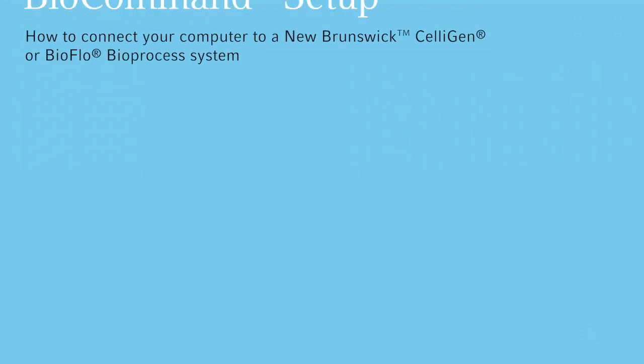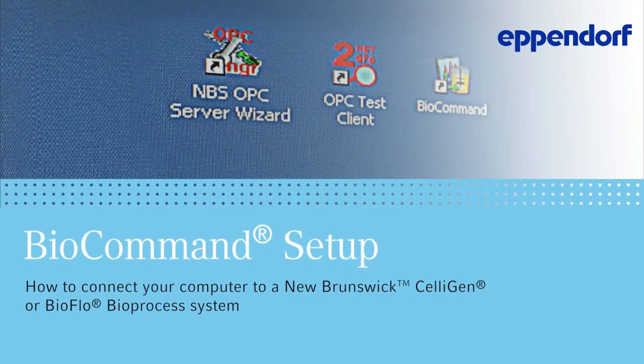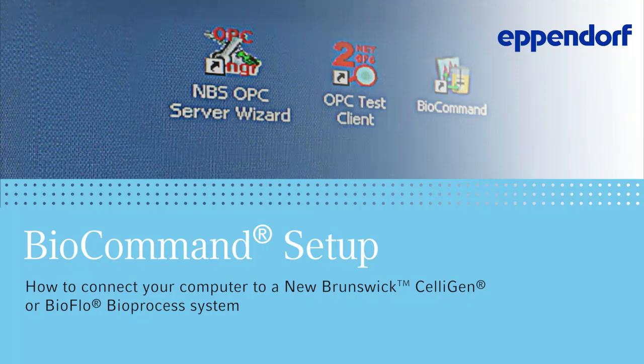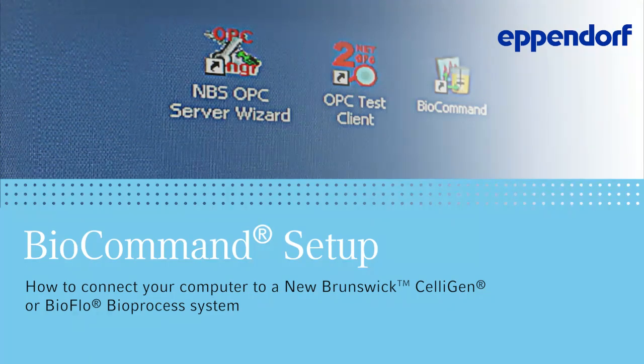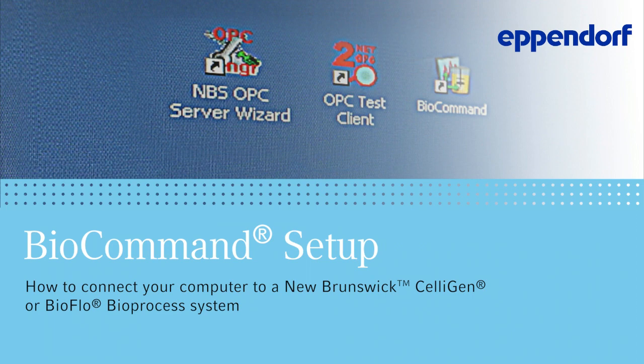The purpose of this video is to demonstrate how to connect your computer to a New Brunswick Celligen or BioFlo Bioprocess system and how to use the BioCommand software package to create a recipe and a batch.